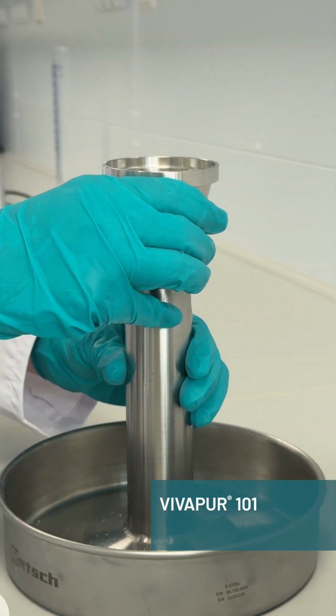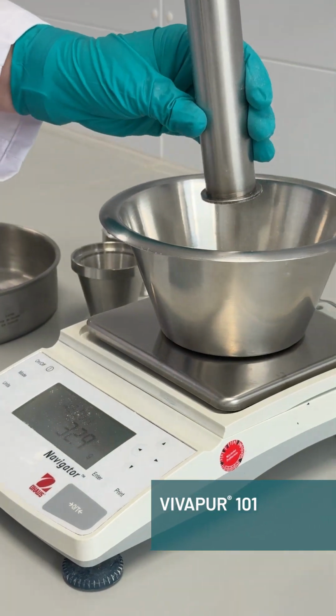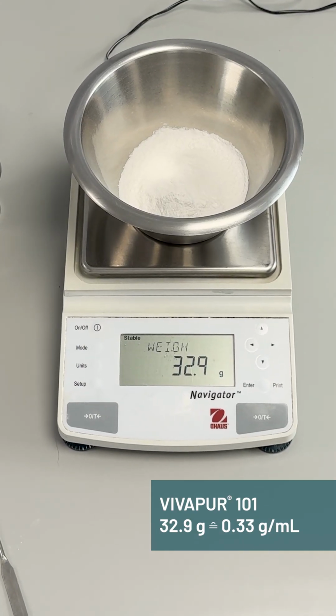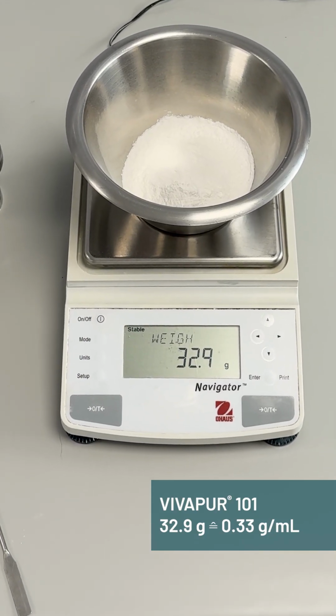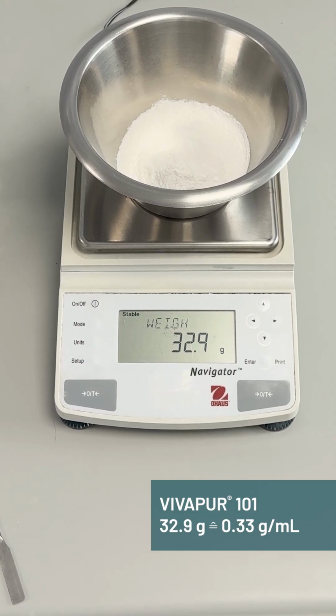I'll strike off. There we go. This material weighs 32.9 grams, a bulk density of 0.33 grams per milliliter. So very similar to ProSolve FSIMC C50, but it had quite a different flow.